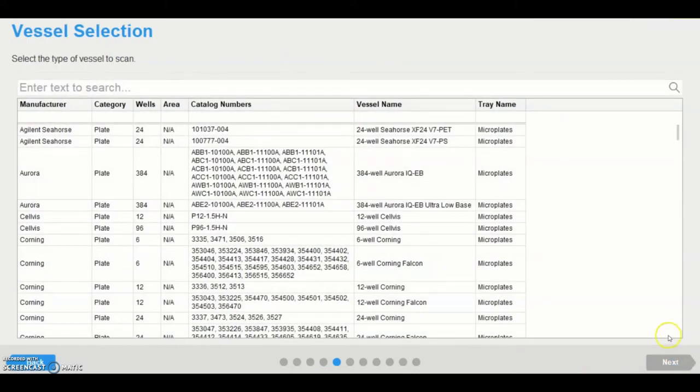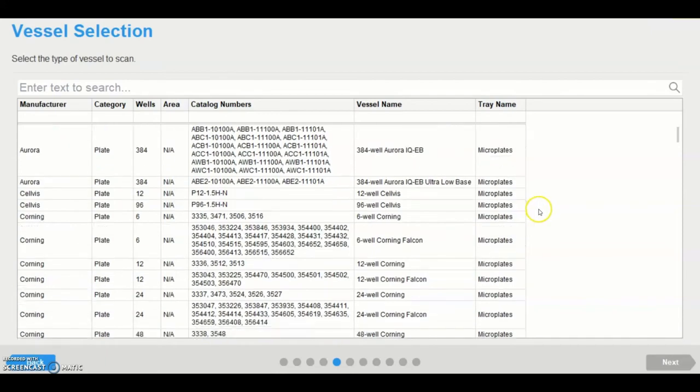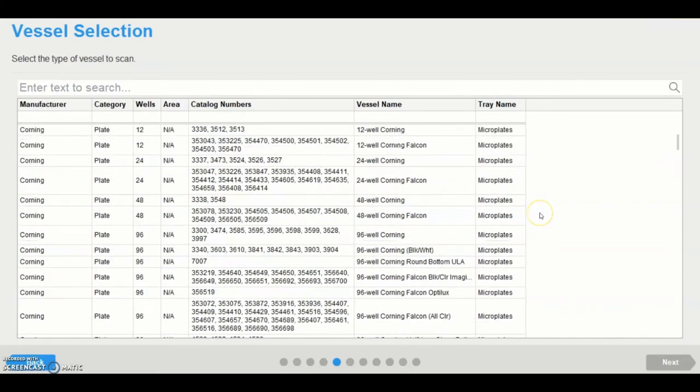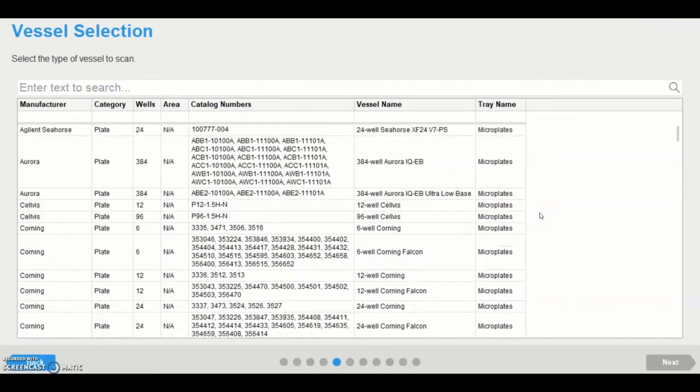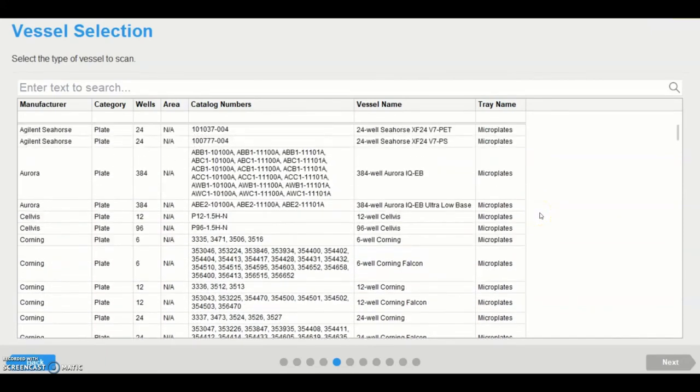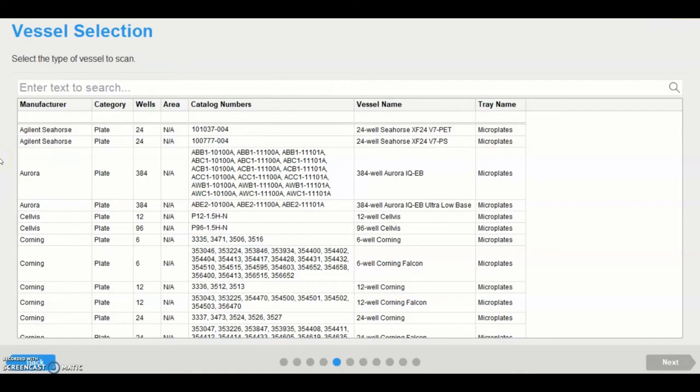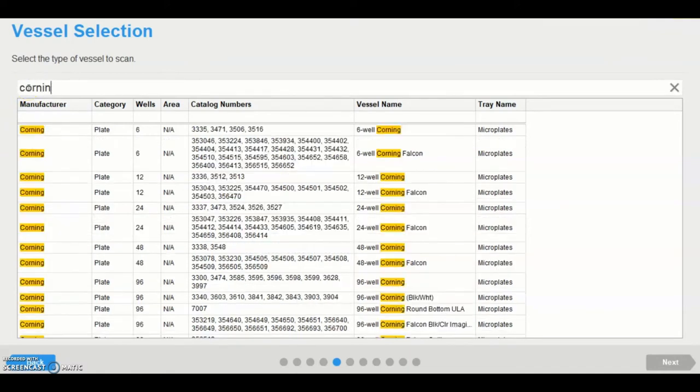The vessel selection page lists all the vessel types that the Incusite system can support. Should a scanning mode other than standard be selected, then only those vessels which are applicable for that scanning mode and objective will be displayed. Users can search for vessels in several ways, for example by manufacturer, catalog number, or number of wells.